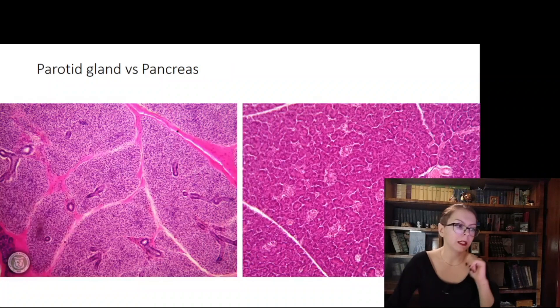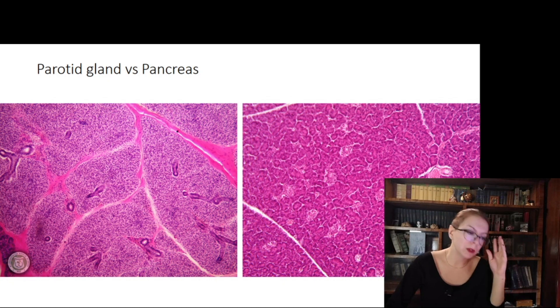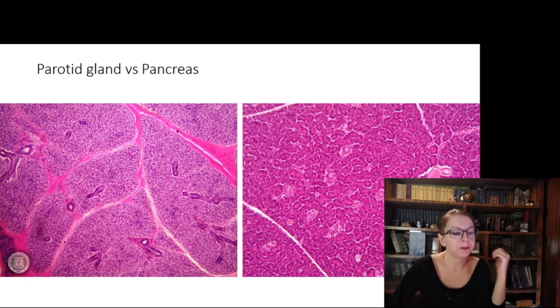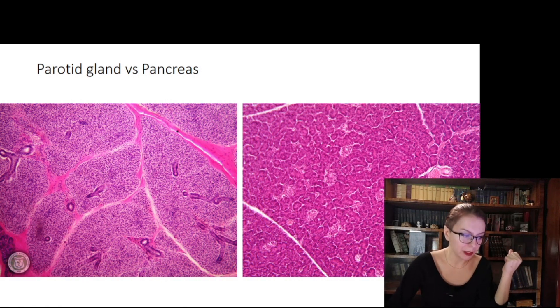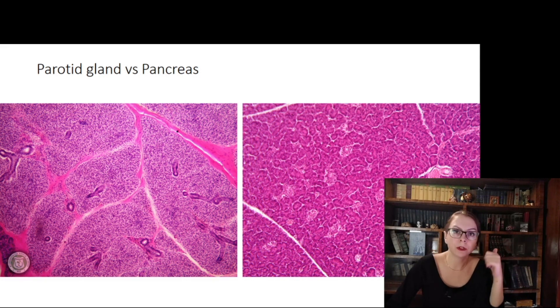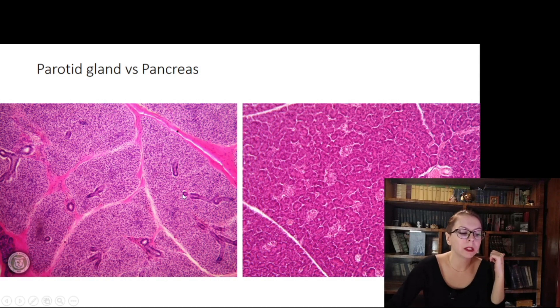The next pair is the parotid gland versus the pancreas — very similar glands because both produce proteins, which is why their cells are stained in a basophilic, purple color. The first criterion helping you distinguish parotid from pancreas is the presence of striated ducts.